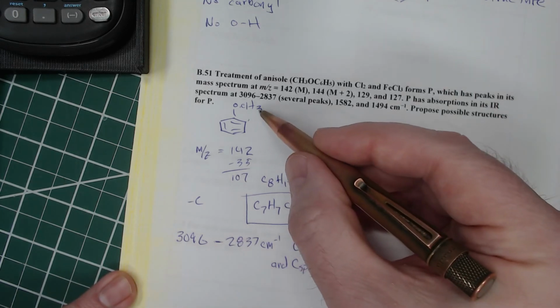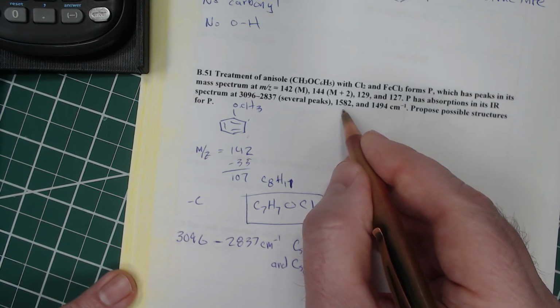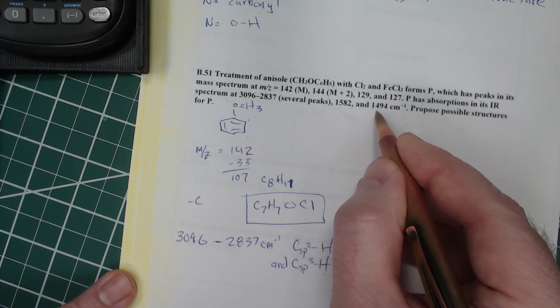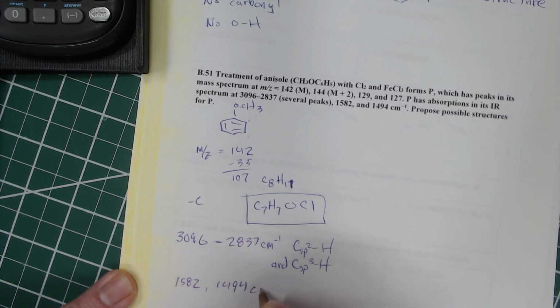So that tells us we probably have that methyl group and the phenyl group still present. All right, the 1582 and the 1494. Again, that's very characteristic. One near 1600, one near 1500 for a phenyl.